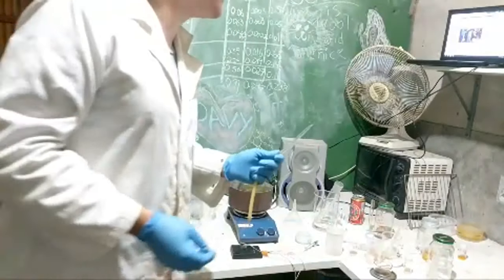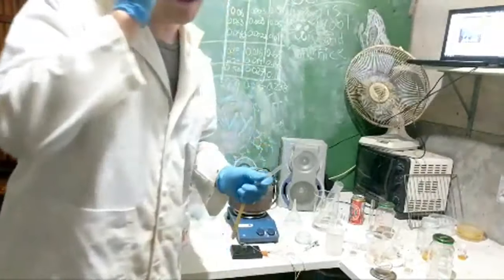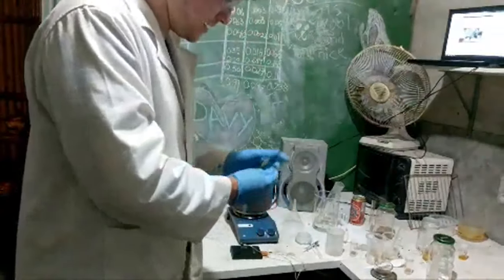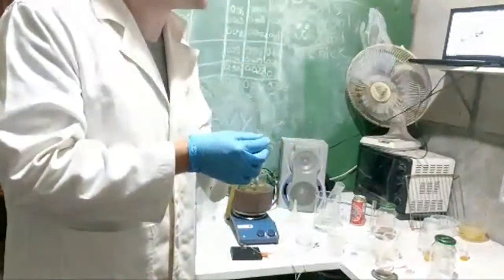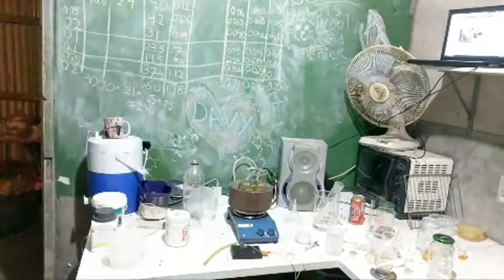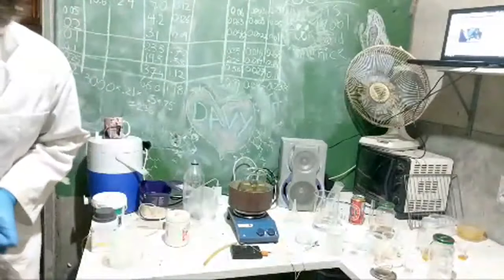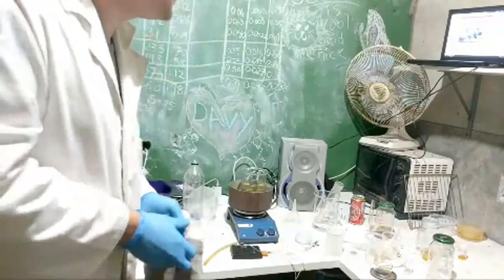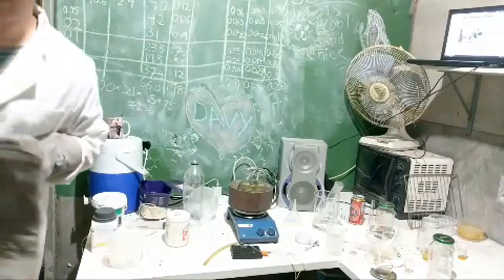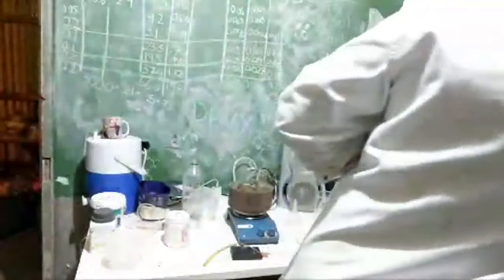See, okay, so what the current predicament is, this thermocouple usually goes into this glass thing, but I currently broke the end. I think I did that in a recent video. So I'm gonna have to flame seal it shut again. So, crack out some fire. Do my risk assessments.